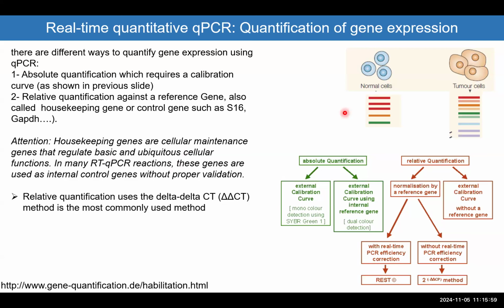But unfortunately, with research, we find out, no, it's not the case. So you have to be very careful which gene you are using as a control. And if you are doing a qPCR and your PCR product is all over the place, think about the control gene you are using. Okay?